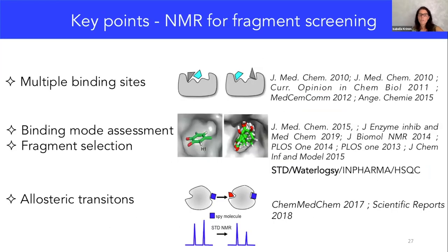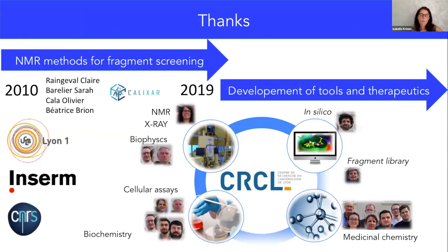So this is just to remind that I showed you what you can do using STD and WaterLOGSY experiments about the multiple binding sites of fragments on proteins, the binding mode assessment, and how to select your fragments, and also how you can use both fragments and NMR to look at allosteric transitions of proteins. And so it was, I would say, the earlier work that I did before.